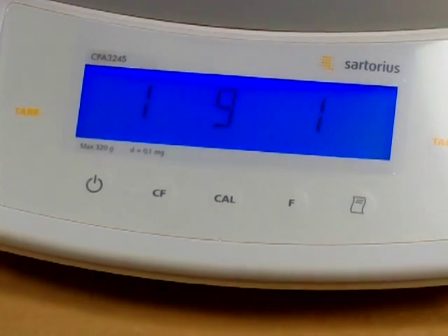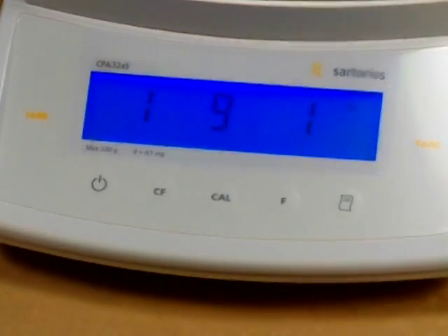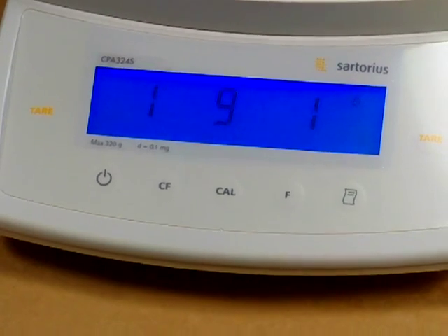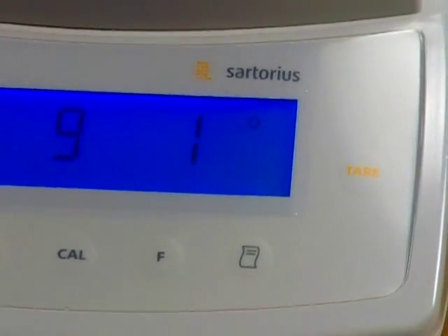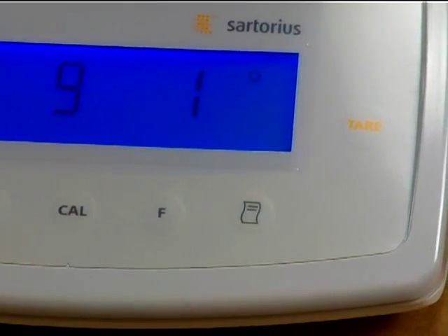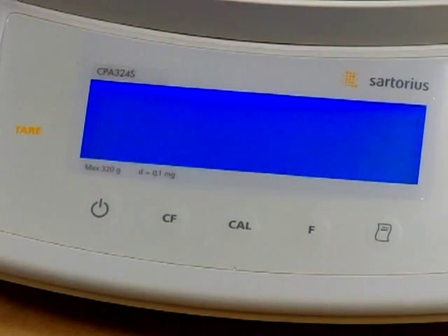So we press the Cal key and now we have 191. We need to store this value — a quick press of the tare key. Notice now there is a zero in the top right-hand corner, meaning the value now stored for the balance is 191. By pressing and holding the tare key, we're resetting the balance to store that value. The balance is now set for external calibration.